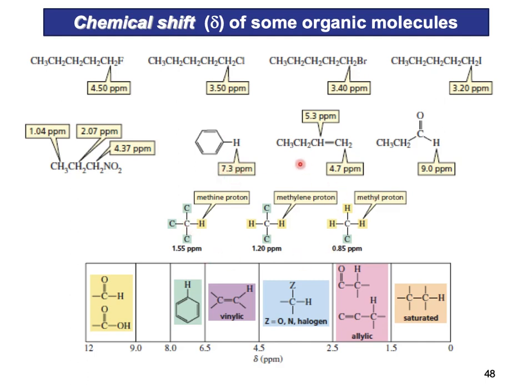So there are different types of functional groups. In the case of this aldehydic proton, you can see it appeared at 9 ppm because of this carbonyl inductive effect, right? This appeared at 9 ppm, the de-shielded region.